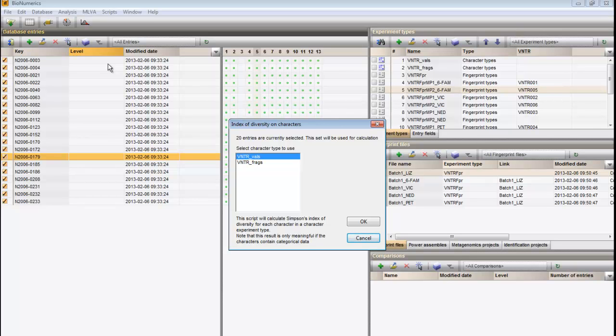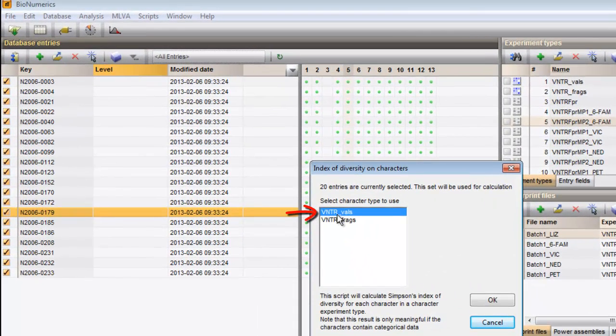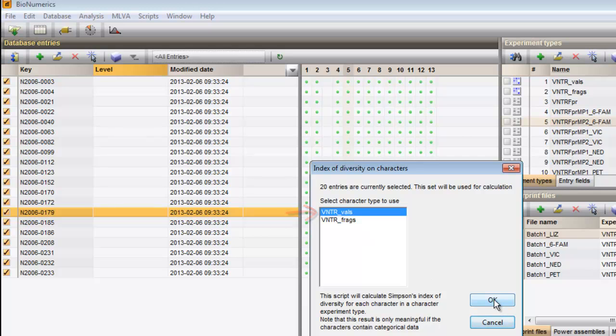Select the experiment containing categorical data, which in this case is VNTR VALs, and press OK.